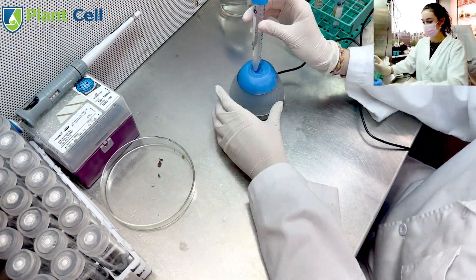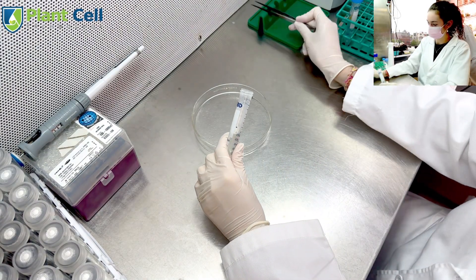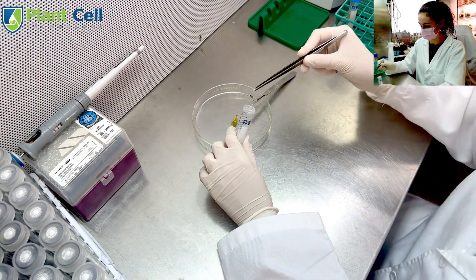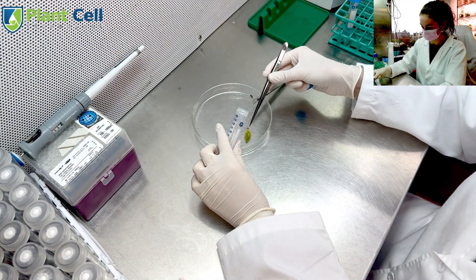I noticed that even after agitating the seeds with a vortex, they would remain attached to the pod. I decided to cut the seeds from the pod with my scalpel and add them directly to the test tubes. Some of the seeds became separated, so it is okay if you have to add multiple clumps to the test tube at a time.